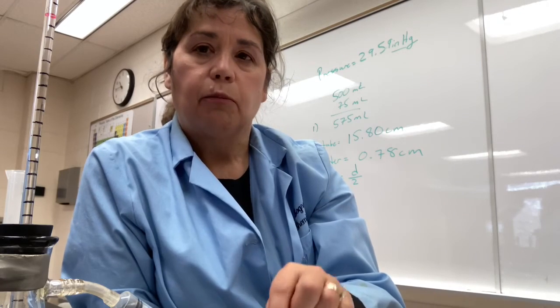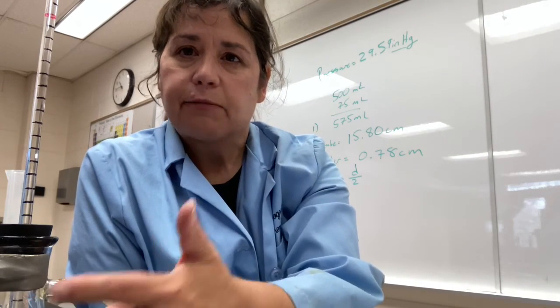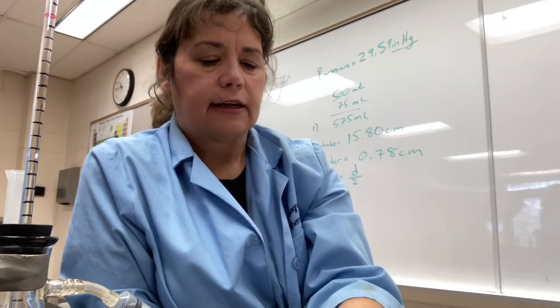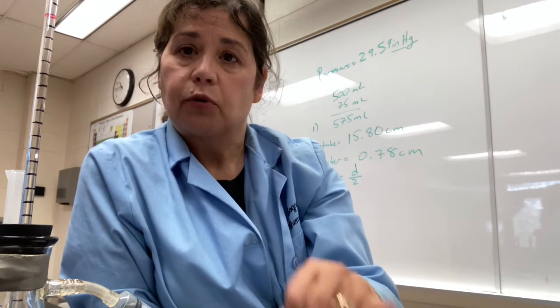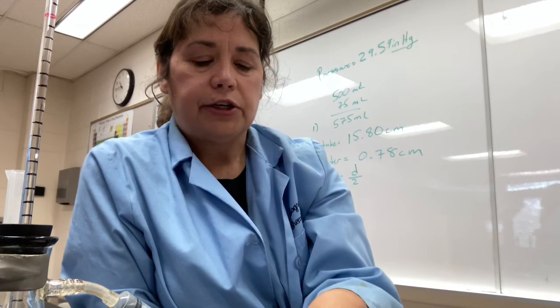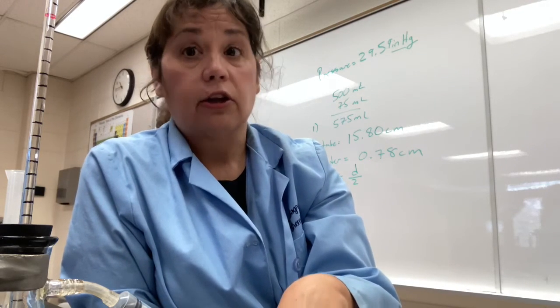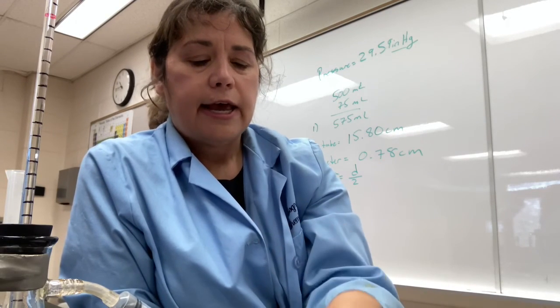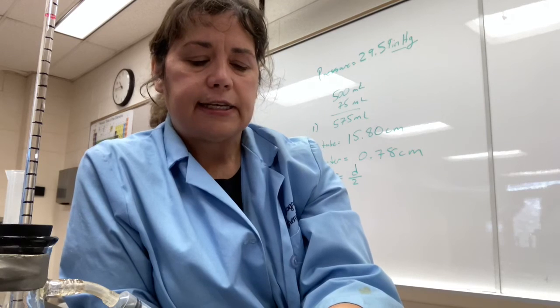Finally, once you get E settled, where you've added column D to line 6 for each value, you're going to multiply the pressure inside the flask by the volume inside the flask. The volume inside the flask is in column B. The pressure inside the flask is in column E. So you're going to do that for each value. And you should see a large number. Don't be afraid if the number's large, it's going to be large. And it should be fairly consistent from top to bottom.